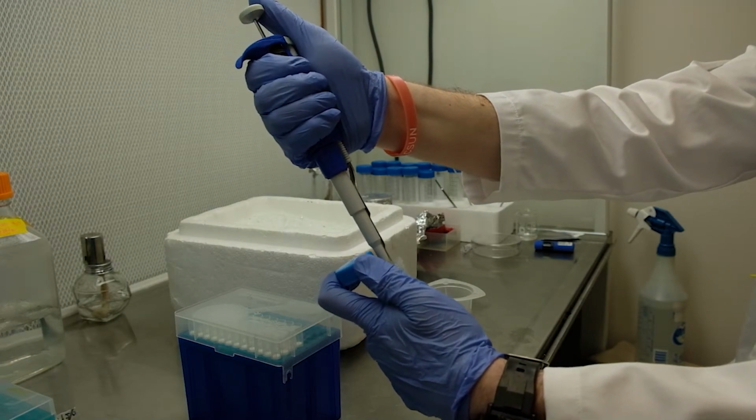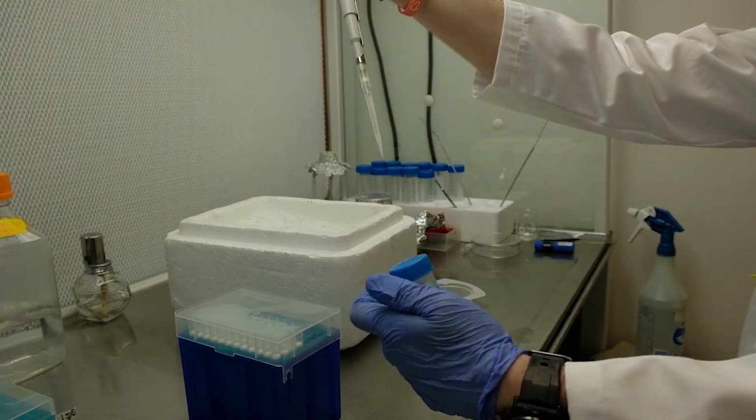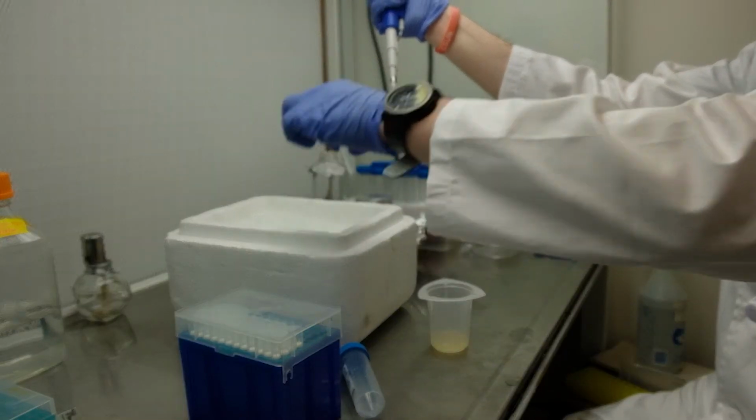Same technique: add about 1 milliliter of 15% glycerol and calcium chloride solution to each one of your tubes containing the pellets.